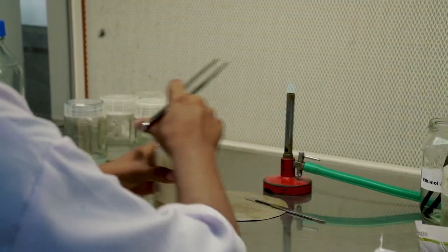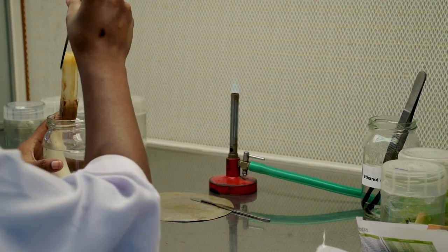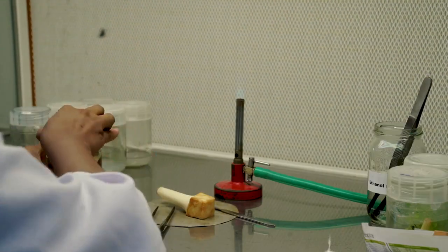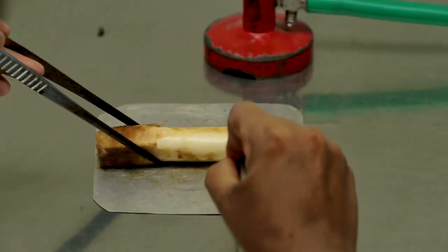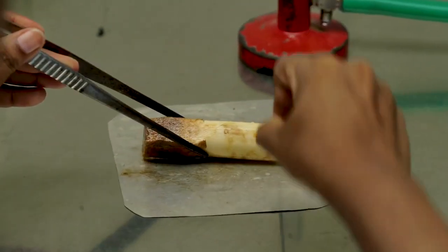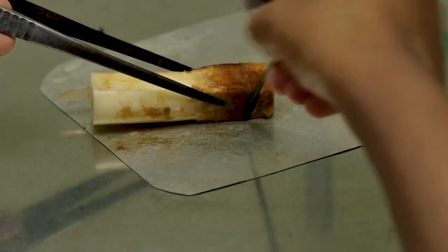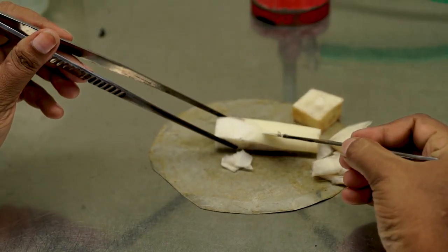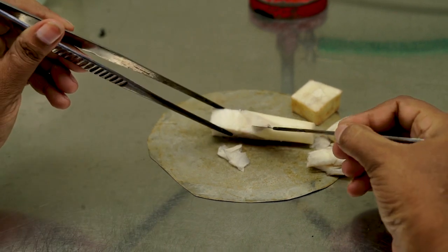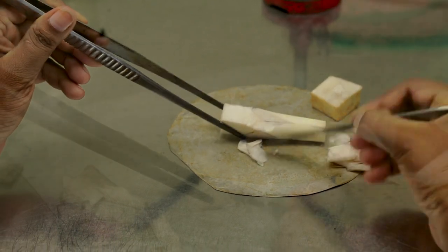Now the shoot tips of 5 to 7 millimeter size will be excised from the rhizomes and trimmed by removing the outer coverings. As you can see here, the size of the explant is around 5 to 6 centimeter. From this explant, the shoot tip ranging 5 to 7 millimeter will be excised by trimming the outer covering of the rhizome part as well as the shoot tip, so that we get the exact size of 5 to 7 millimeter of the shoot tip.